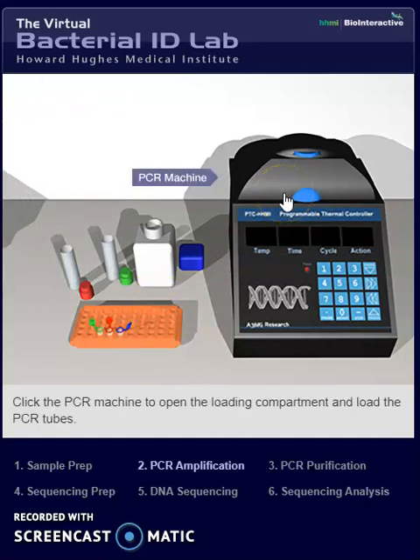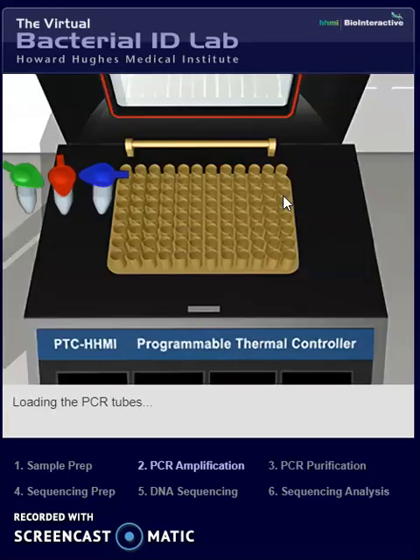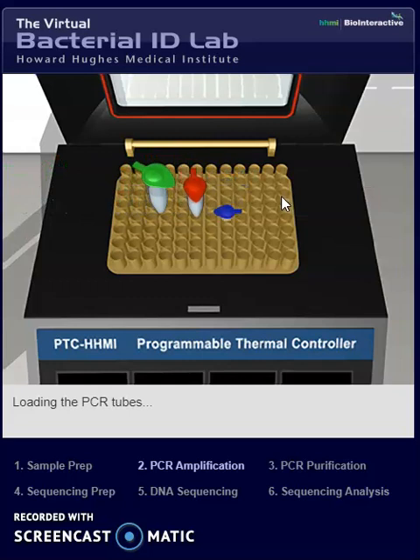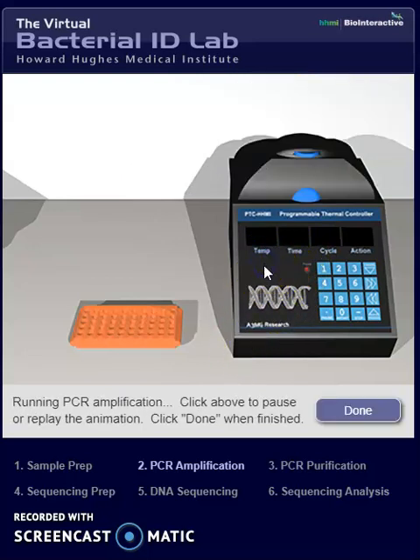Adding water to the negative control PCR reaction tube. After that, we will have to load the PCR tubes into the PCR machine. After the PCR tubes have successfully been loaded into the PCR machine, click the PCR machine to continue.